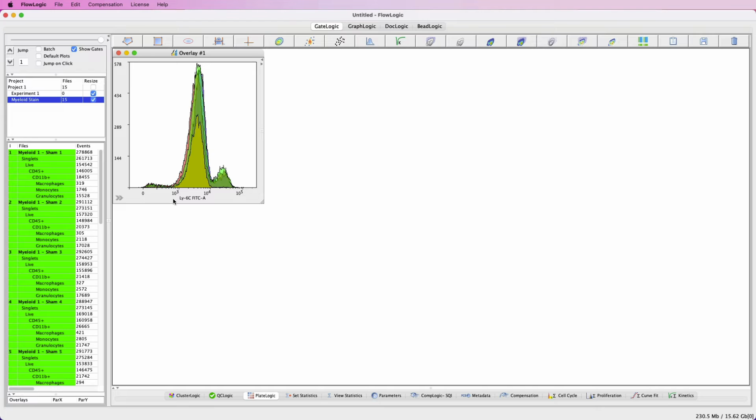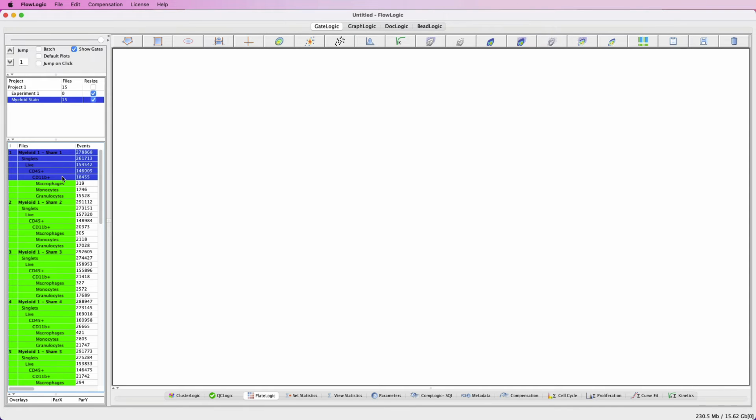Now that we have performed our basic analysis, it is time to generate some statistics.